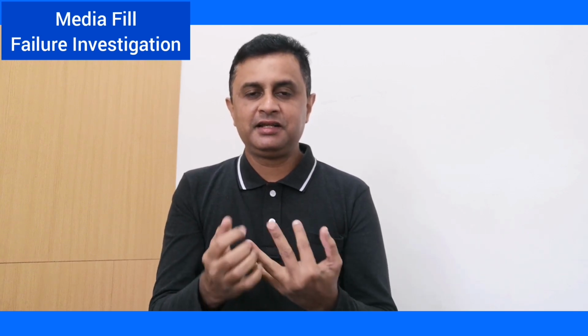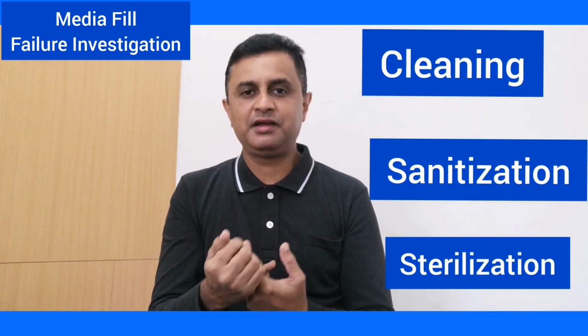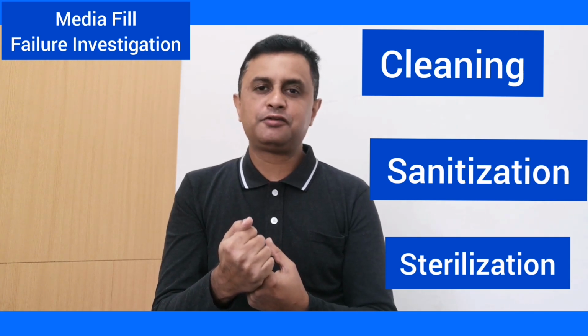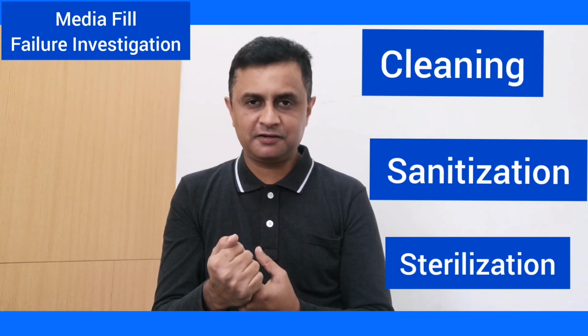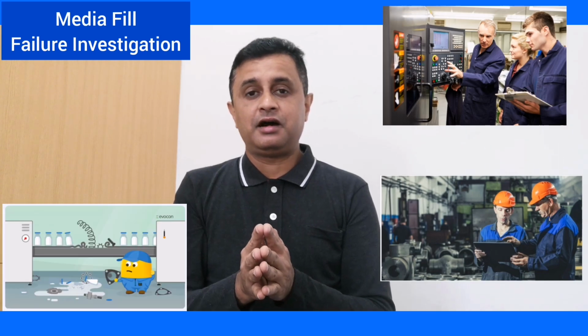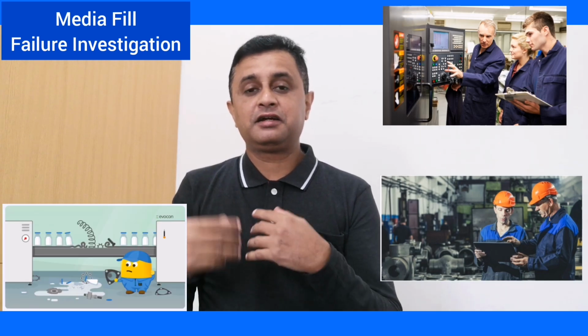We should check cleaning, sanitization and sterilization. SIP failure will mostly lead to gross failure, but still we need to check. We should see whether there are any new operators, or whether they have done any new intervention. Have we done anything unusual?